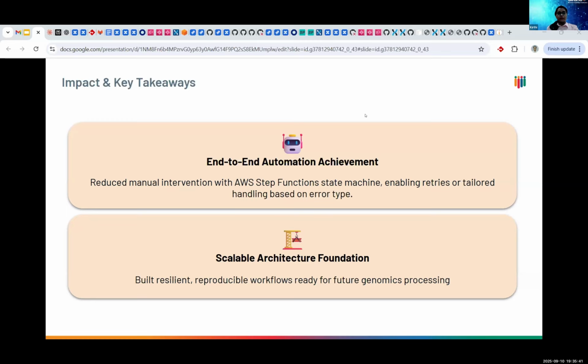So to wrap up, I would like to say that this transformation on moving on from a complete DNAnexus setup to using other platforms like ICA has also enabled us to give an MRD WGS pipeline that is way faster, cheaper, scalable, and reproducible, as we are using the state machines for it, and they are automated to a certain degree.